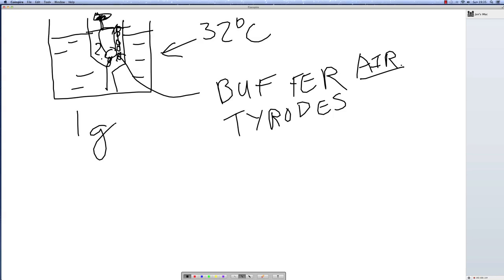And when it contracted, it would pull on the string, perhaps, but not very hard. By putting 1 gram of tension on it, when it contracts, it is actually pulling very hard. So you can actually detect the signal. It needs this bit of tension so that we can see the contraction when it happens. So that's the actual setup.